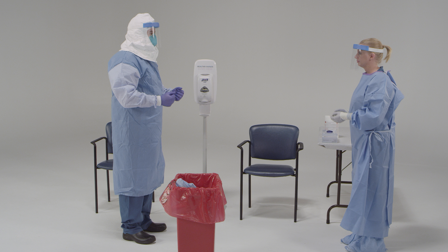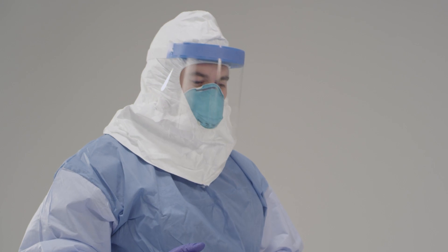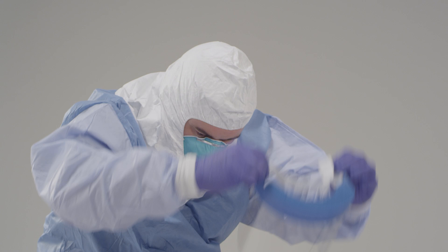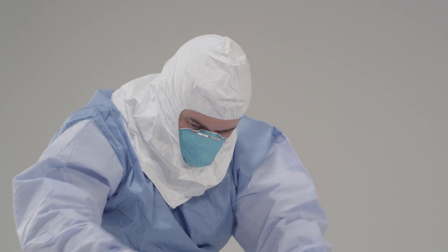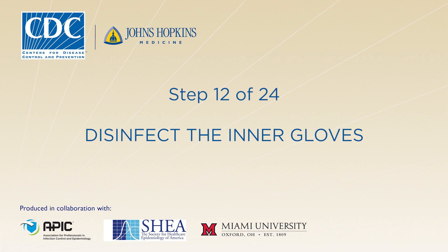In this step, you will take off your face shield. To do this, tilt your head forward slightly, grab the strap at the temples, and pull it forward and over your head, which will let the face shield fall from your face. Dispose of the face shield. Now disinfect your gloves.